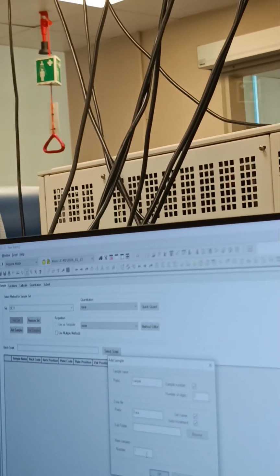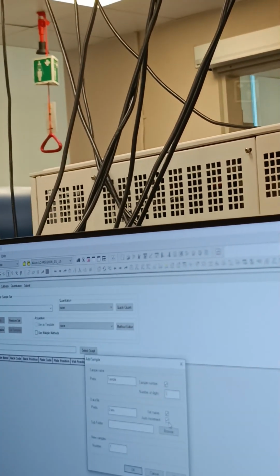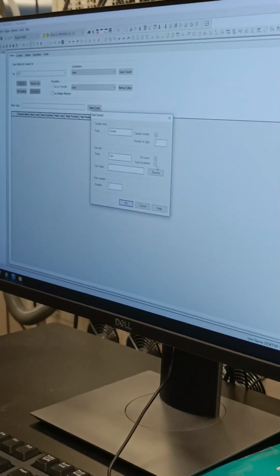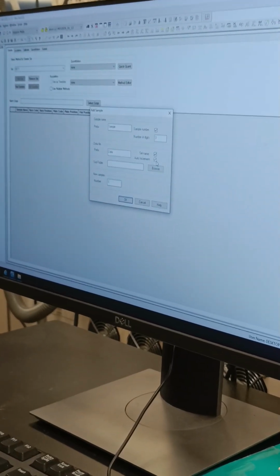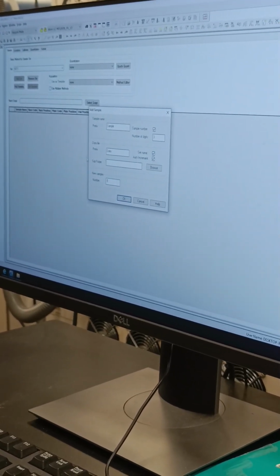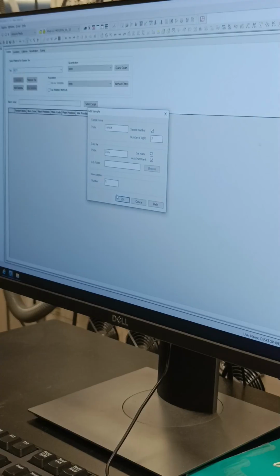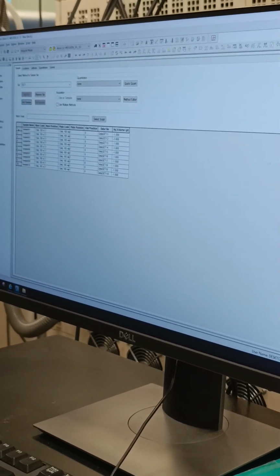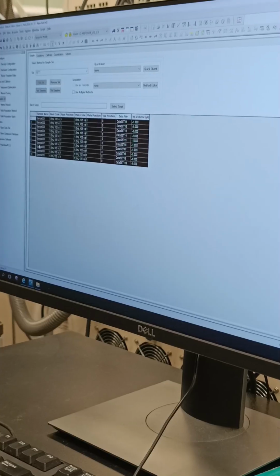Because I've already extracted 60 samples, and usually I will include my own blank samples and QC samples, so usually I'll make it up to maybe 70. This one I will just create 10 first, like blank ones, and then I'll delete them again.